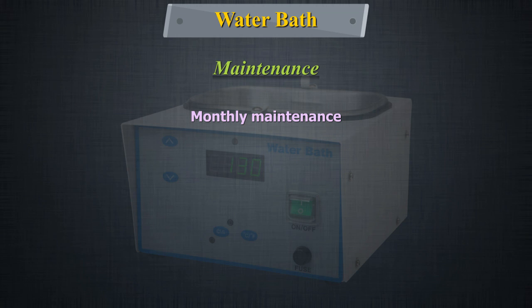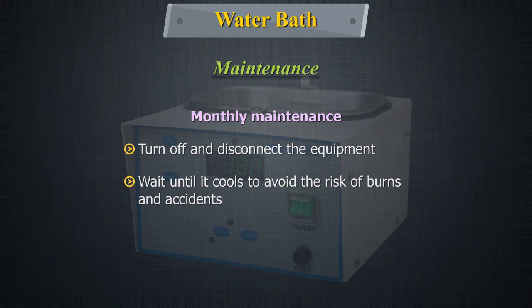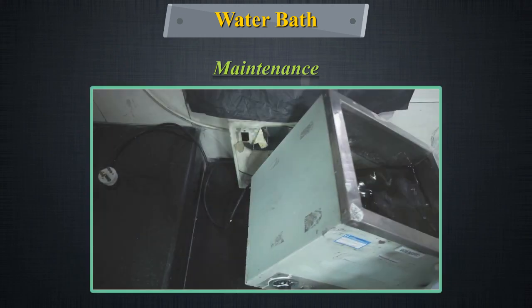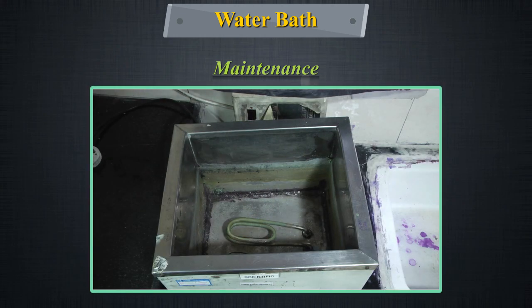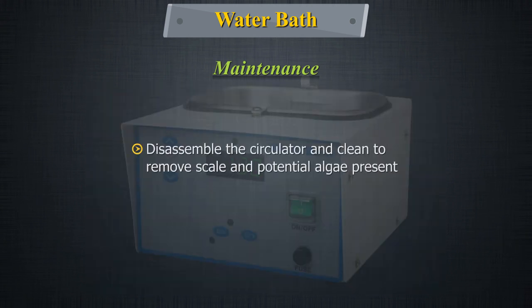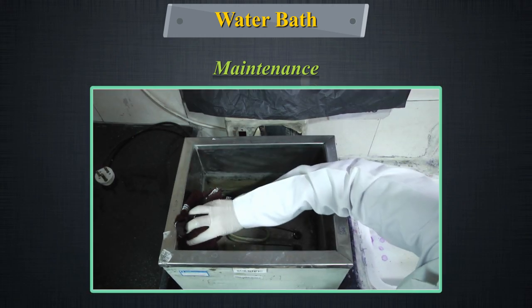Monthly maintenance should include turning off and disconnecting the equipment. Wait until it cools to avoid the risk of burns and accidents. Remove the water used for heating. Remove the thermal diffusion grid located at the bottom of the tank. Disassemble the circulator and clean to remove scale and potential algae present. Clean the interior of the tank with a mild detergent.